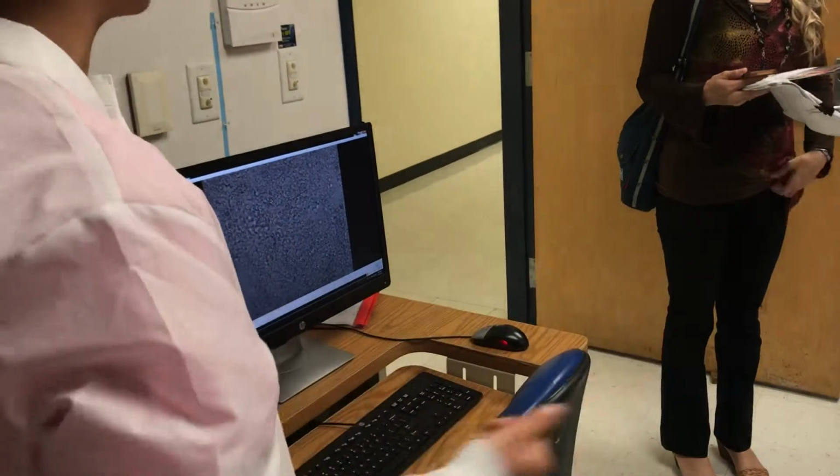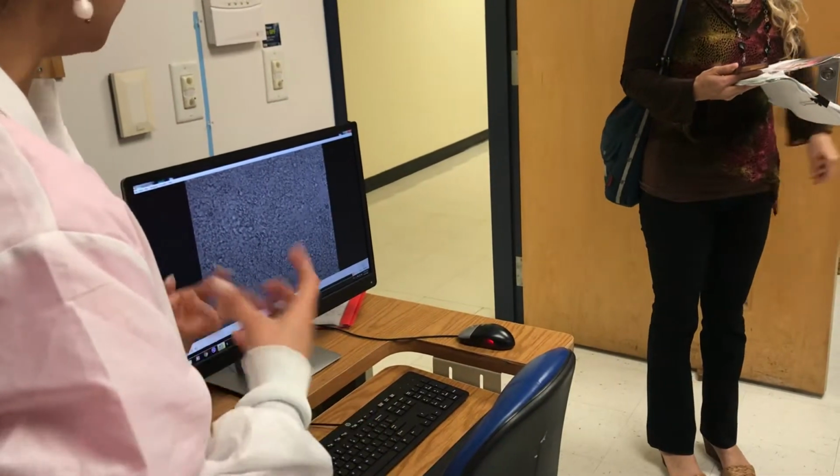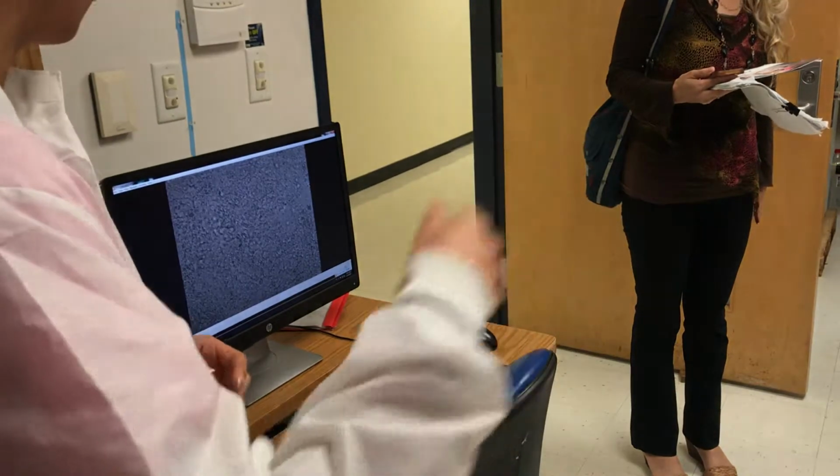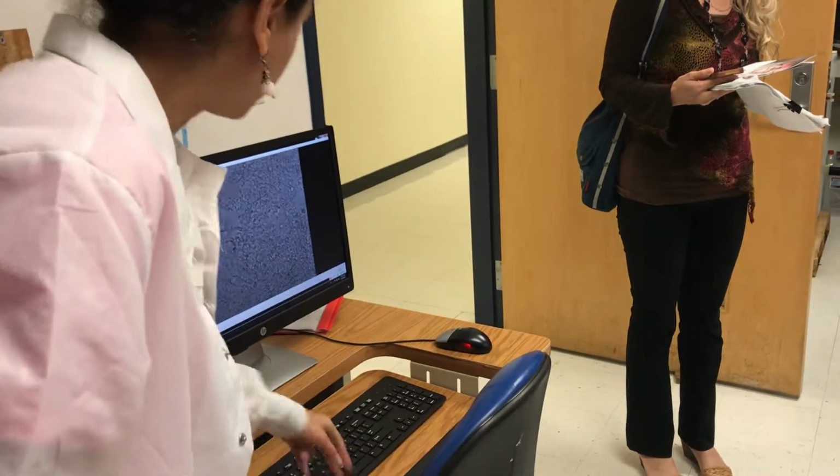I wish I had some. I have some growing right now in there, but they're not old enough to beat right now. It takes another 7 days for them to beat. Otherwise, I would have showed them under the microscope. So this is what we got.